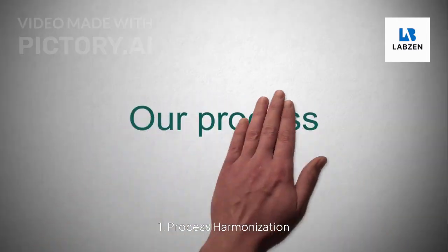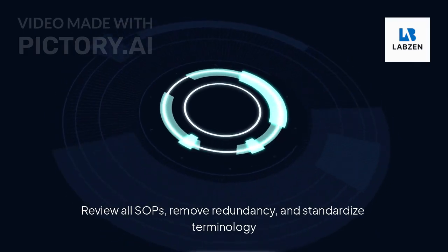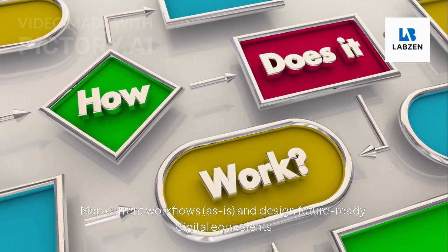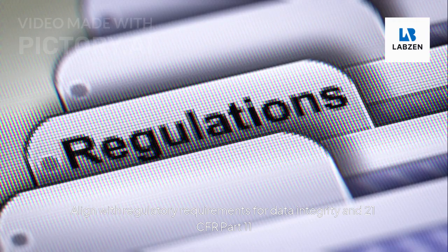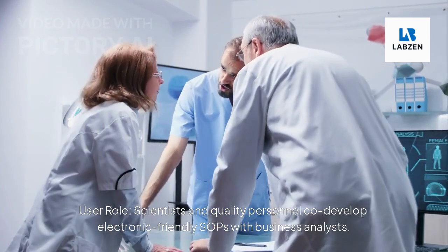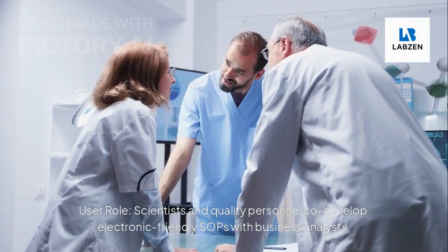1. Process harmonization. Review all SOPs, remove redundancy, and standardize terminology. Map current workflows as-is, and design future-ready digital equivalents aligned with regulatory requirements for data integrity and 21 CFR Part 11. User role: scientists and quality personnel co-develop electronic-friendly SOPs with business analysts.